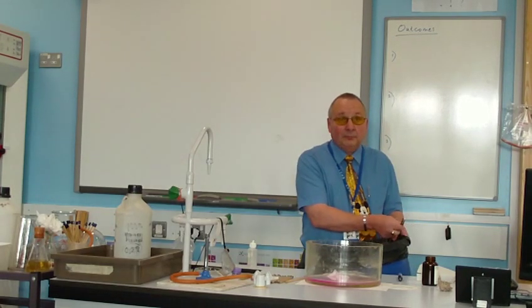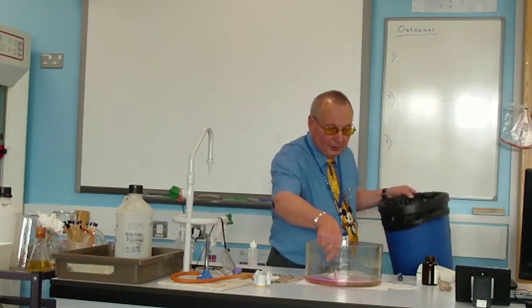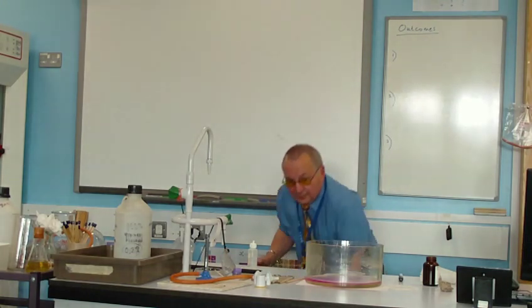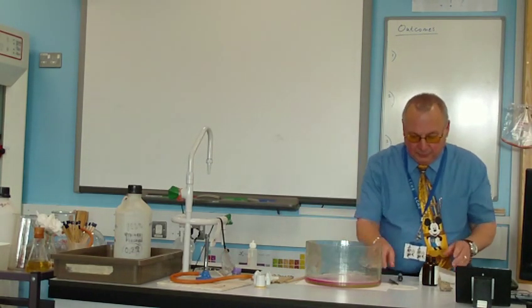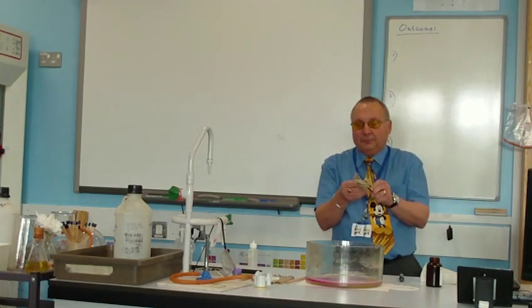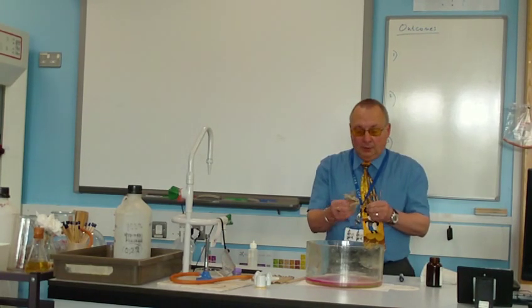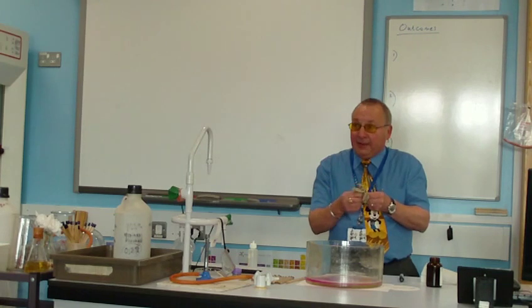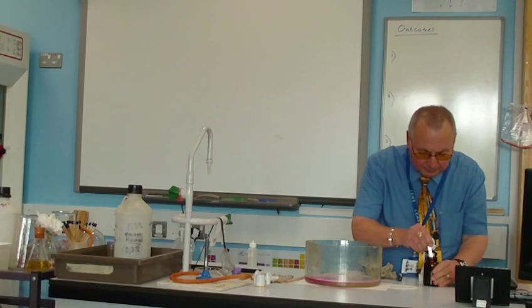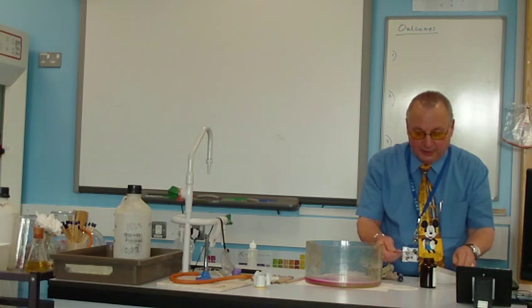What didn't I do? Carry it across the floor, in case I dropped anything off it, right? Right, so I've not even got the filter paper on this one. This will be wet. And what have I got to keep these metals away from? Water. So I really ought to get that dry, didn't I? So, let's have a look at potassium. Are you alright? That's really soft.